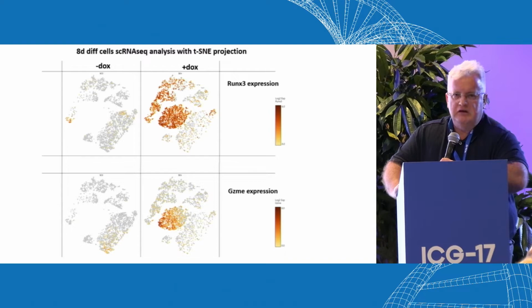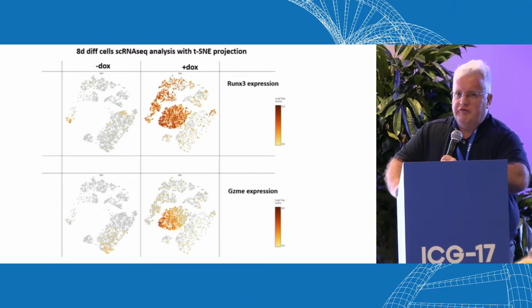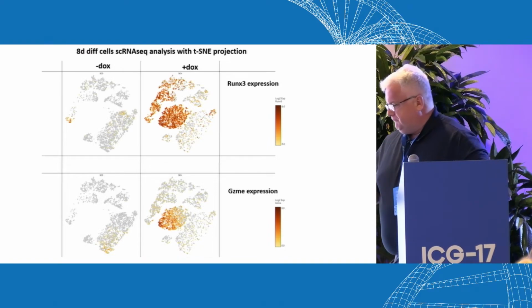This analysis was performed with the Illumina technology, but as was mentioned in the previous presentation, some converting kit is available. So in the future, we also think about using the MGI sequencer because the reagent cost is lower, and we can get deeper sequencing results.